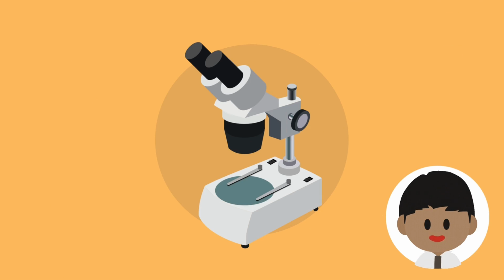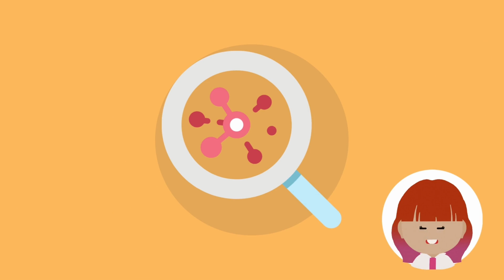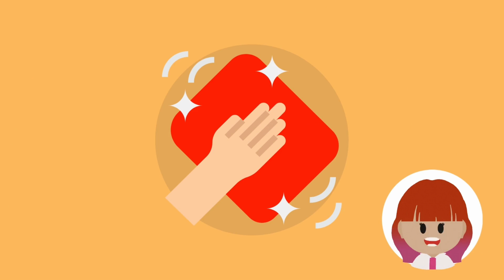Even if given a high magnification, but is low in resolution, the image will not clear up no matter what. The resolving power denotes the smallest details that a microscope can resolve when imaging a specimen, enabling you to look at its finer details. Take note that the resolution can also be affected by the cleanliness of the lens. Make sure that it is always clean before and after every use.